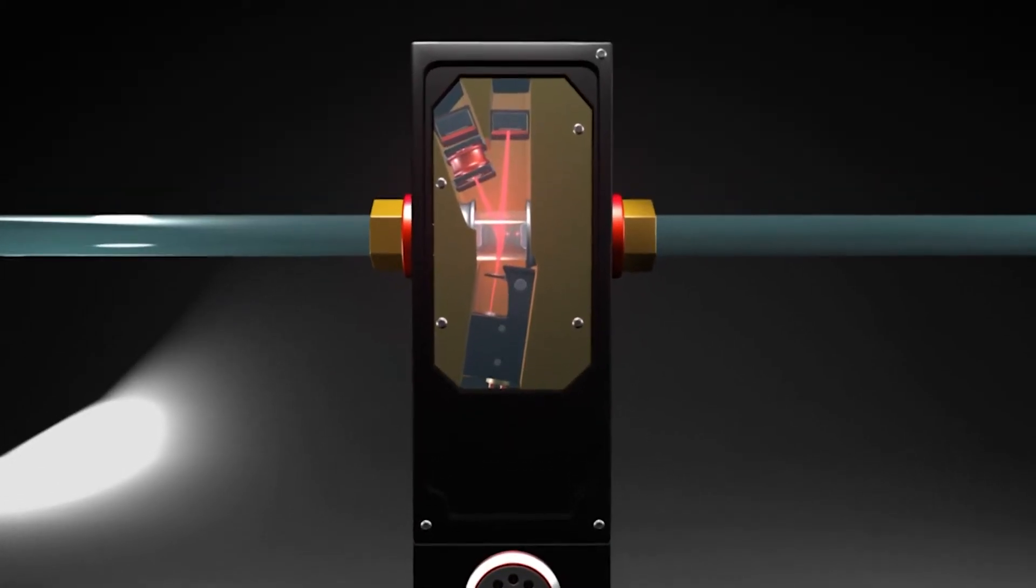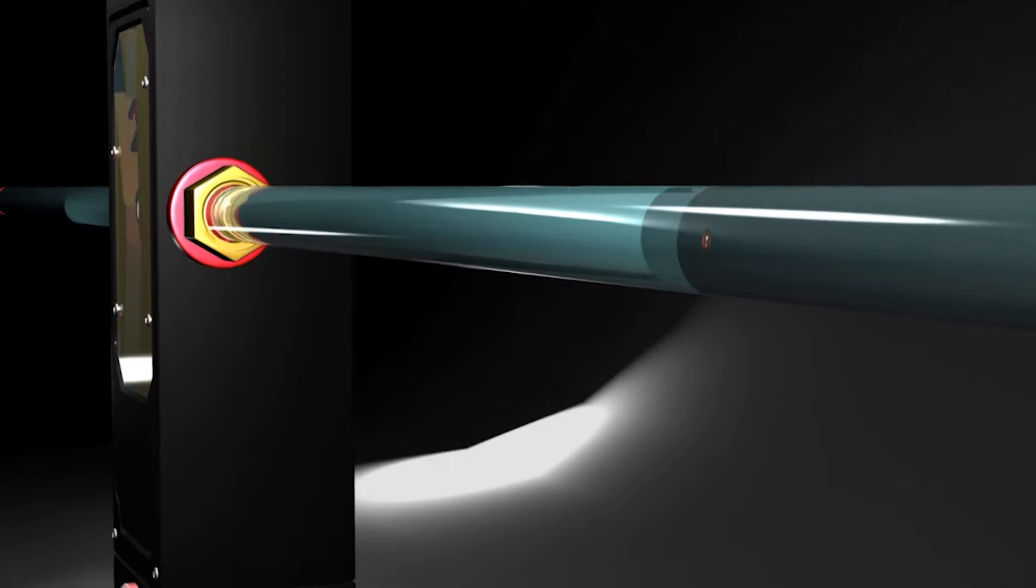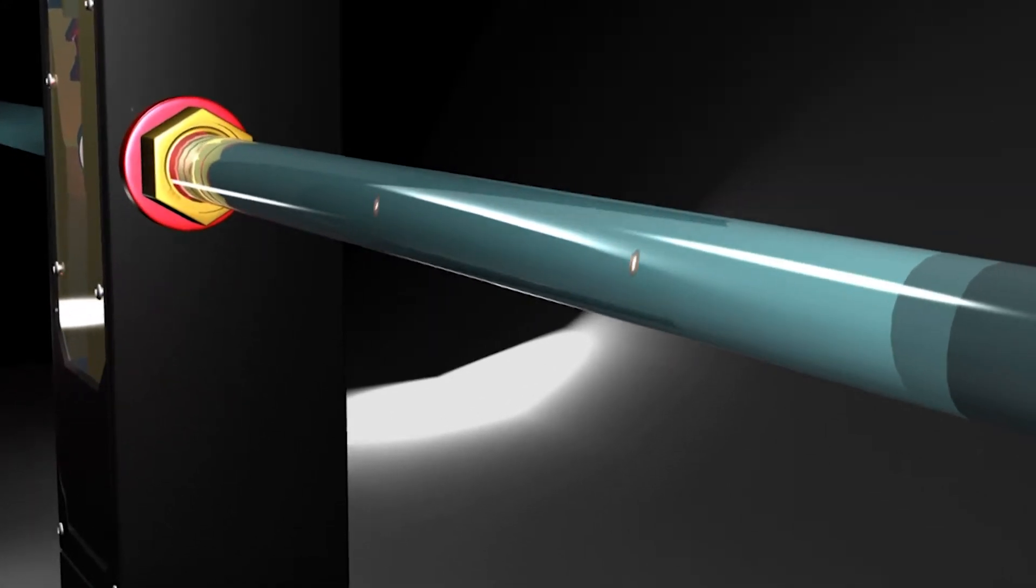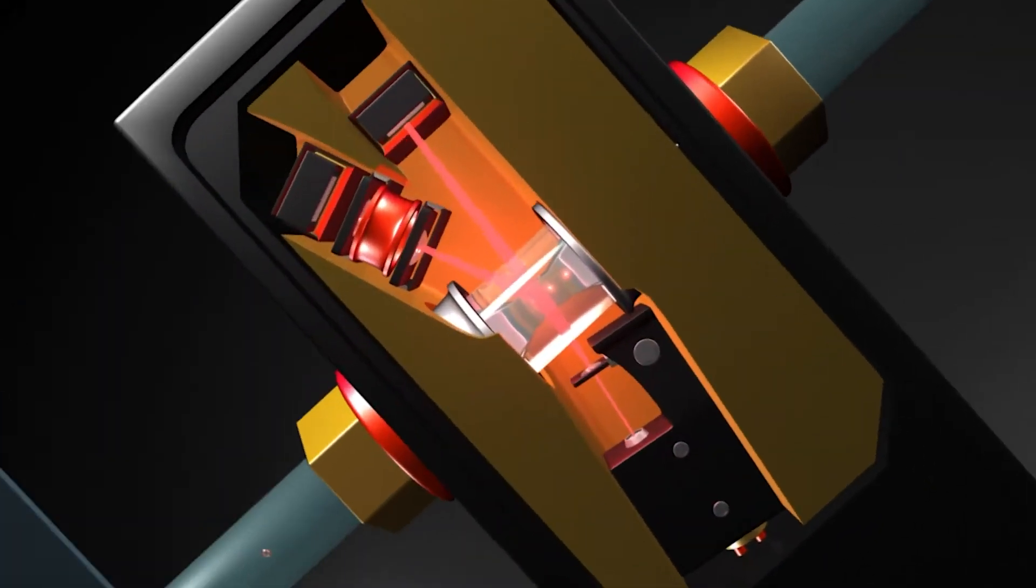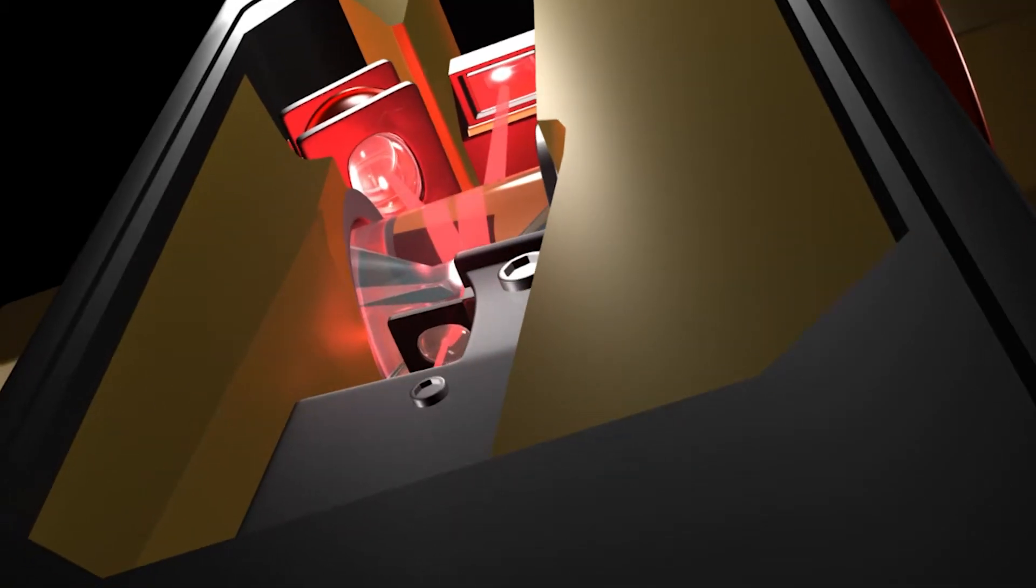The AccuSizer is based on the technique of single particle optical sizing, or SPOS. As particles in a liquid suspension pass one at a time through a sensor, they both block and scatter the incident laser light.